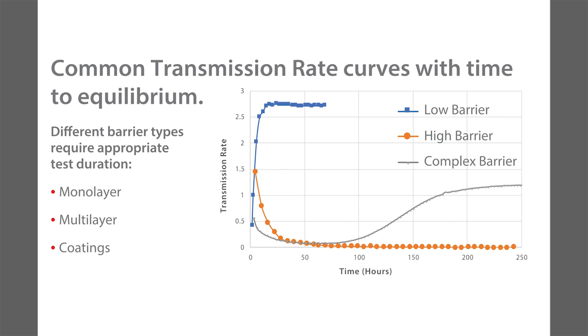Unless you have a material that we've characterized in the past and know takes longer, then we can charge extra time for that, because time on instrument is a cost. So that's important. If you have your own equipment, you may be doing R&D and you'll take it out because you want this data. We've had some customers have us test for like 1,800 hours or longer, to show maybe they've got a desiccant or a scavenger embedded in their package, to make sure the transmission rates stay low for a long time.